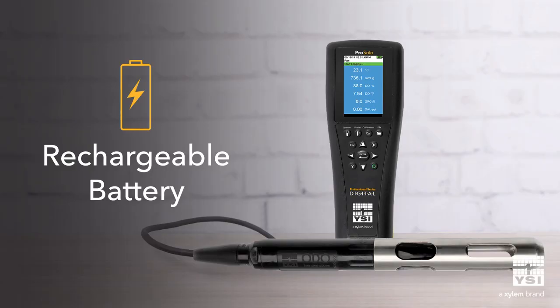Now let's discuss the key improvements that enhance performance and make it easier to use. First of all, the ProSolo uses a rechargeable battery. This eliminates the need for constant battery replacement, saving you time and budget on batteries. A fully charged ProSolo battery will operate the instrument for up to 20 hours.